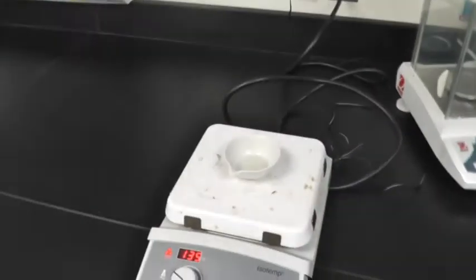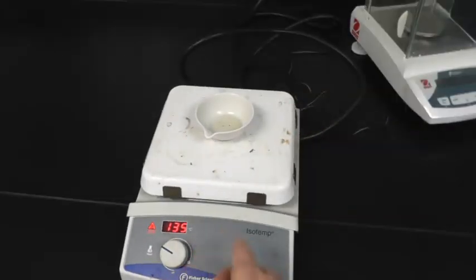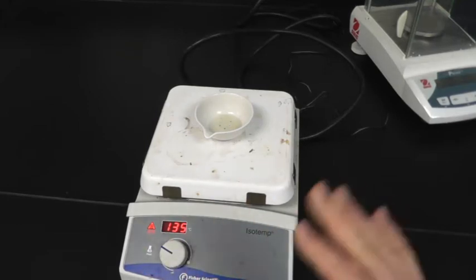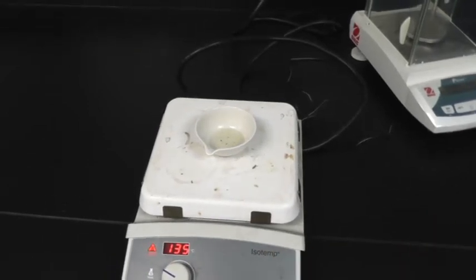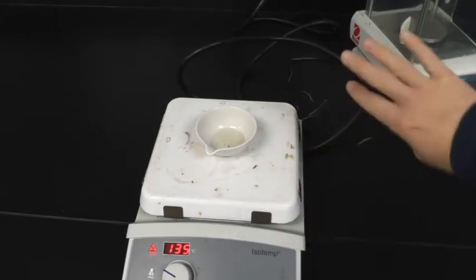What's going to happen over the course of the next 20 minutes is it's going to stay on here, and after 5 minutes I'm going to turn it up to 270, and after 5 minutes 405, and after 5 minutes we'll turn it all the way up to 540. So it's going to stay on here on ever increasing heat for about 20 minutes, because right now we're trying to get all the water out. So it's called an evaporating dish because we want to get all the water out.